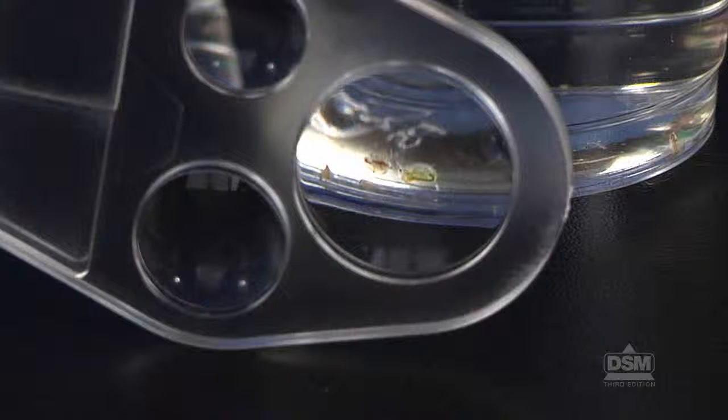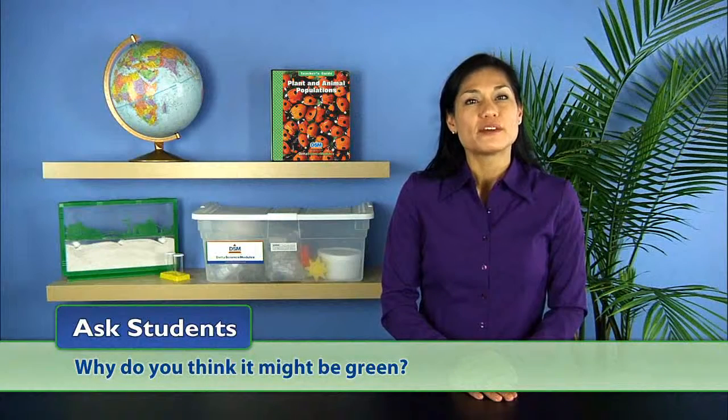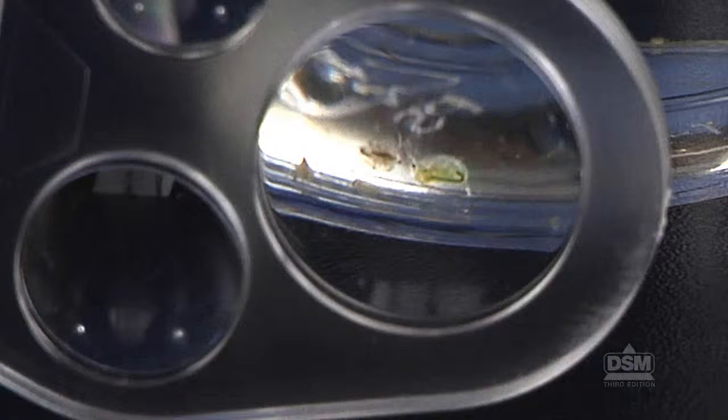Ask students, what color is the digestive tract of your Daphnia? Students should be able to see that it is green at one end and darker or black at the other. Then ask, why do you think it might be green? Students will probably guess that Daphnia eat algae, which color their digestive tracts green. Explain that Daphnia are filter feeders, removing not only green algae, but also other tiny organisms from the water and eating them.